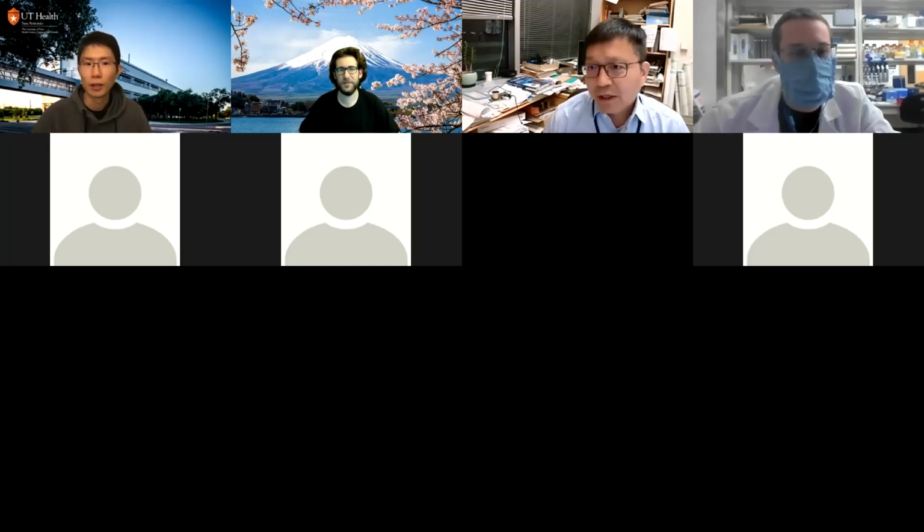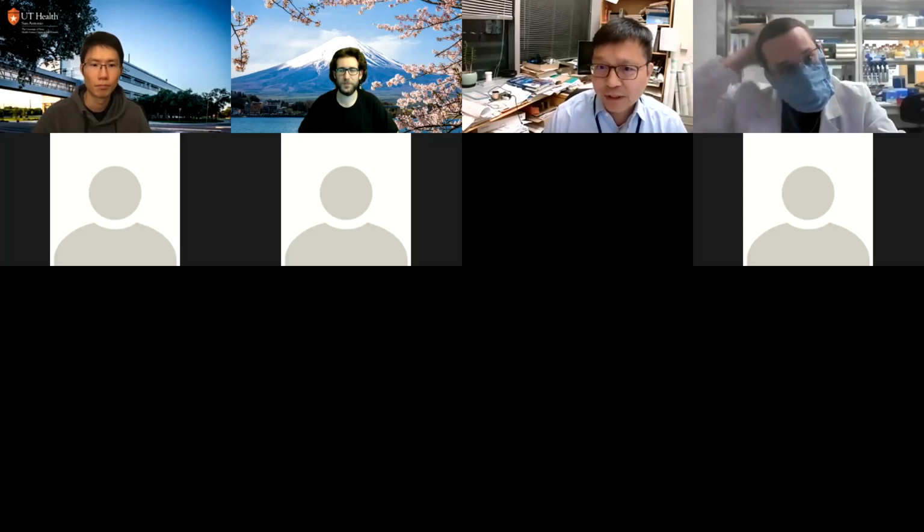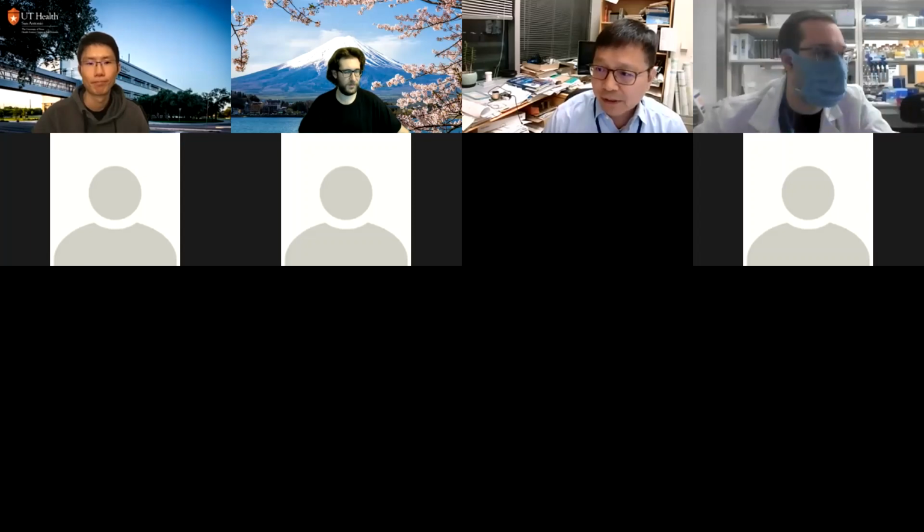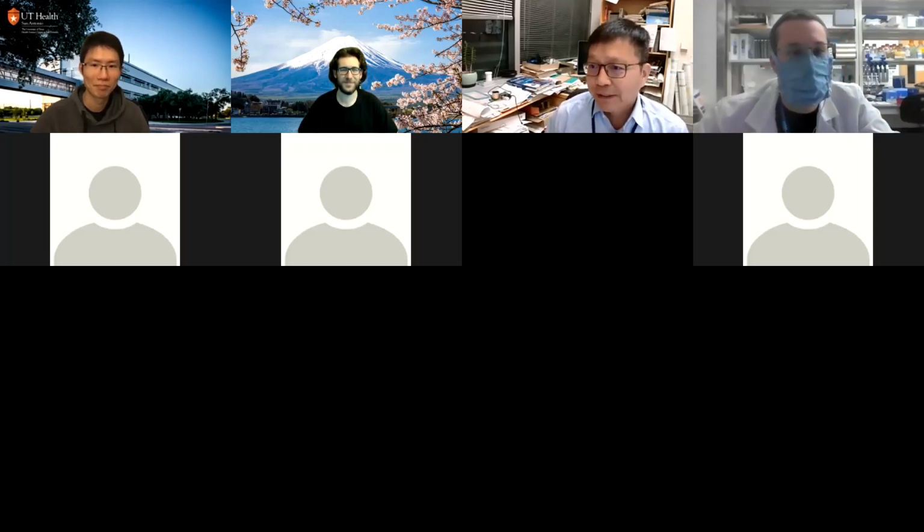Yeah, but you can convert from all these things if you want. It's just not ideal. Ideally, with DESeq, I'd still recommend going with the read count and just rounding to the integer. But people have all these tools, and I'm sure you can find a tool converting back and forth all over the place, because these are very common units that people use.